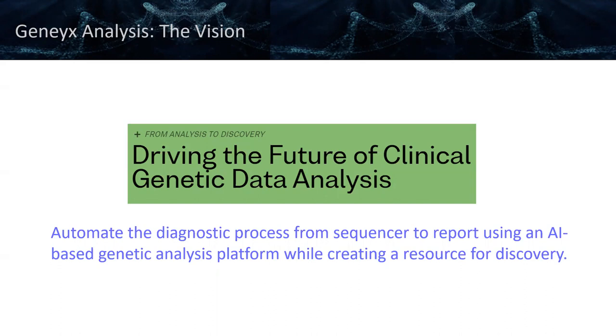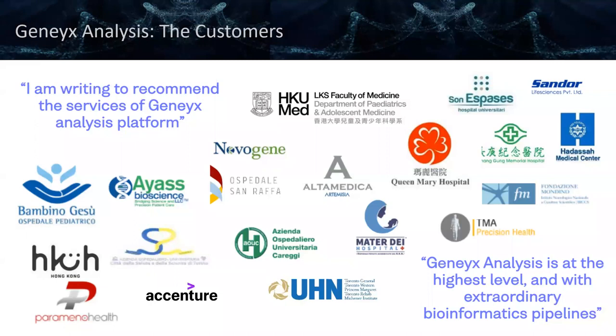A testament to our vision is really our customer base. We have over 80 customers and close to 100 publications. Over 100,000 cases have been analyzed with our software. The customer base is composed of top tier research institutions, governmental organizations, research and clinical settings, hospitals, and diagnostic labs. Really, it's a diverse field, but underlying all of these, they are all using the Geneyx Analysis platform for their NGS data analysis. So I wanted to take a couple of minutes to talk about the software.